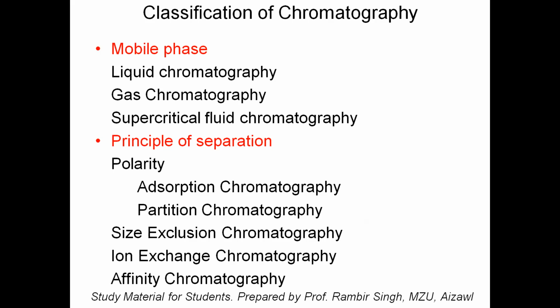So in ion exchange chromatography, what change did we make in the stationary phase? We made the stationary phase charged, either positive or negative. If the stationary phase has a positive charge, all the anionic proteins bind to it, and all positively charged proteins are flushed out.